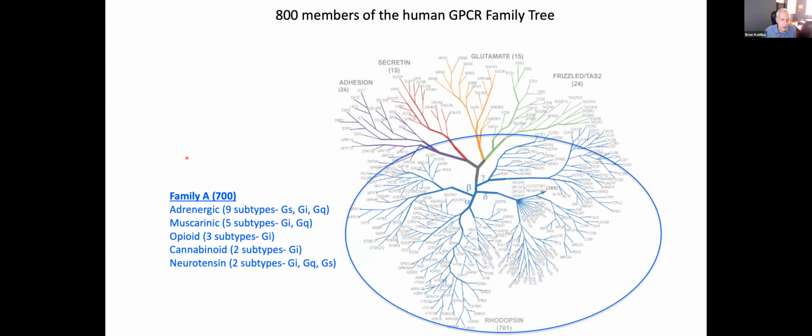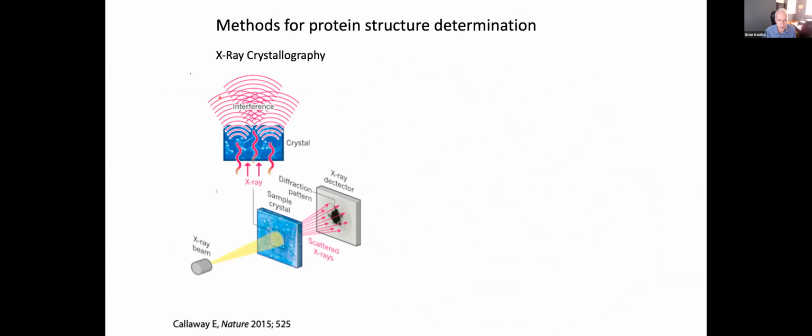So we began to accumulate some other receptors that we thought were particularly of clinical interest and interest for a number of other reasons. And we were able to develop 6 different GPCR G protein complexes, so different receptors, different G protein subtypes. They were all very stable, but with one exception, we had no crystals. One, we were able to get really beautiful looking crystals, but they had no diffraction at all. So this is from 2012 to 2017, and now the advent of cryo-electron microscopy.